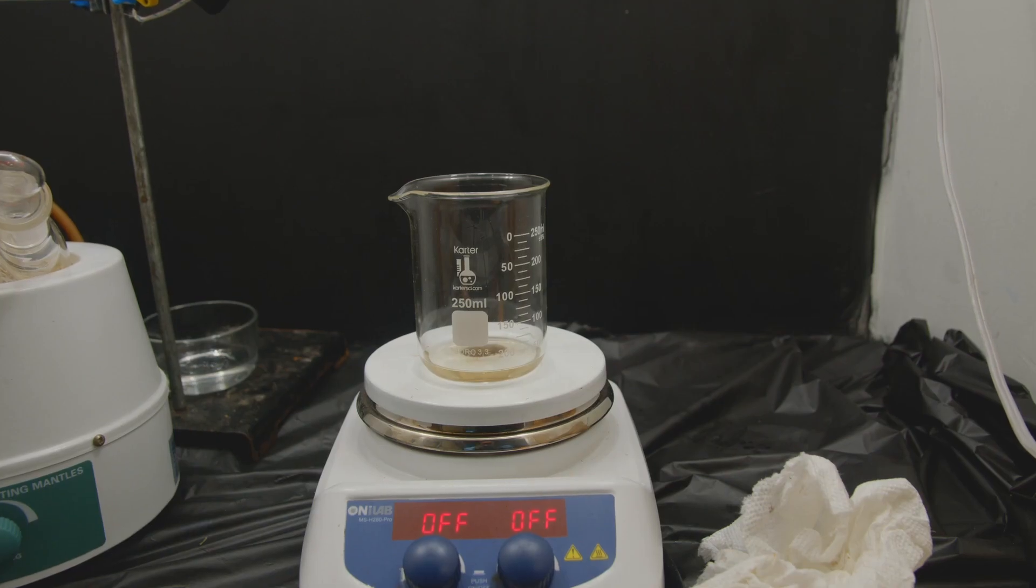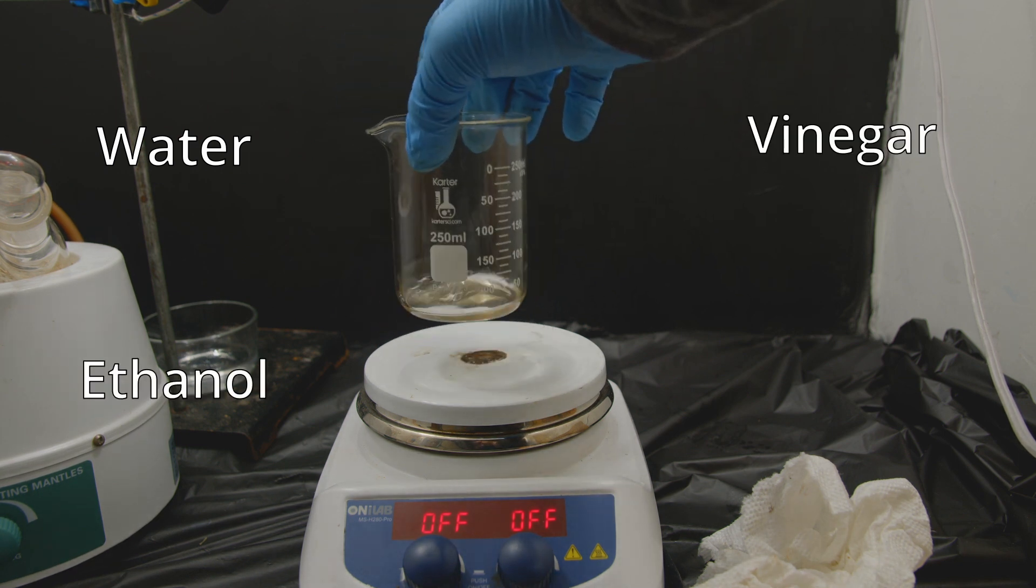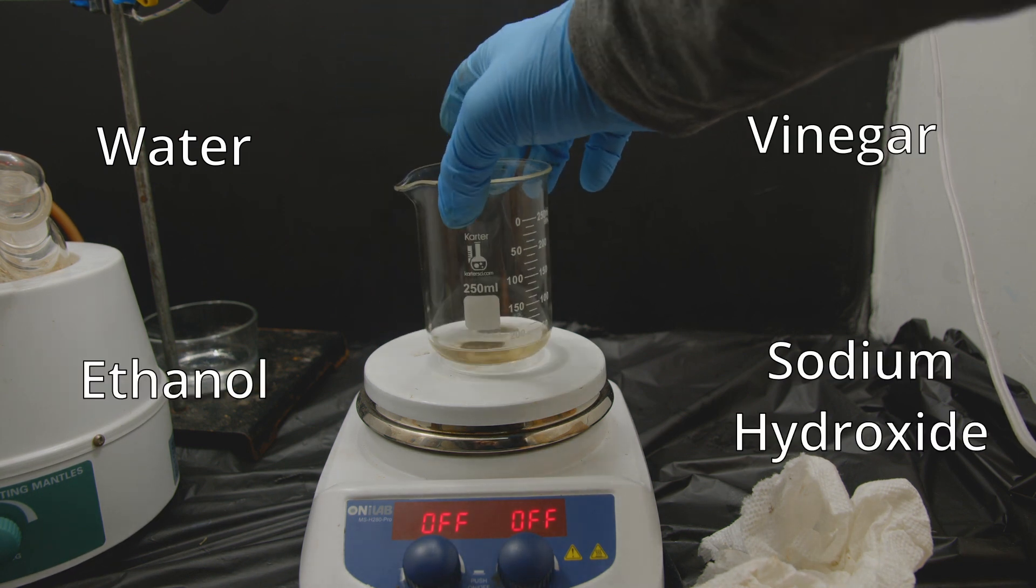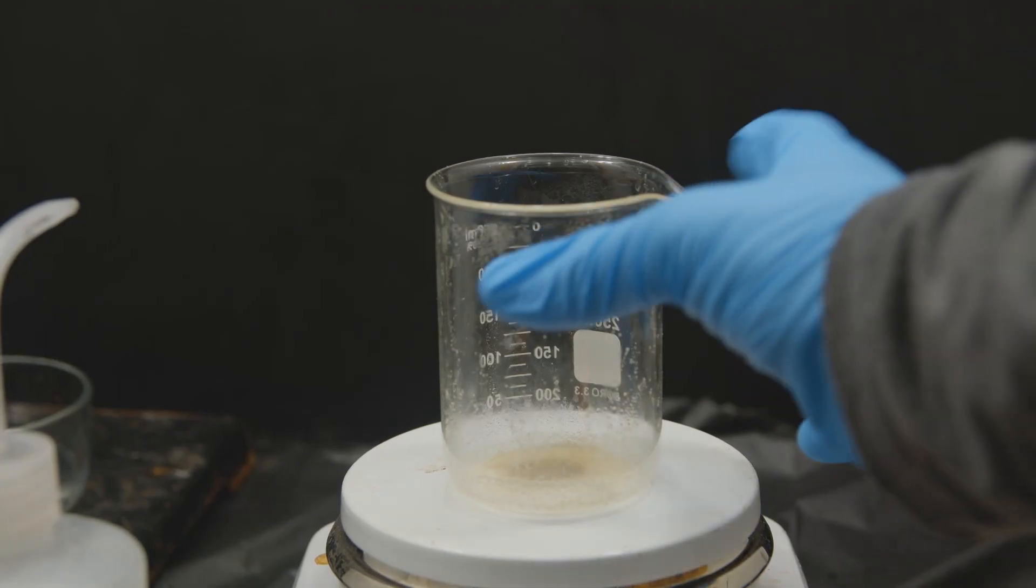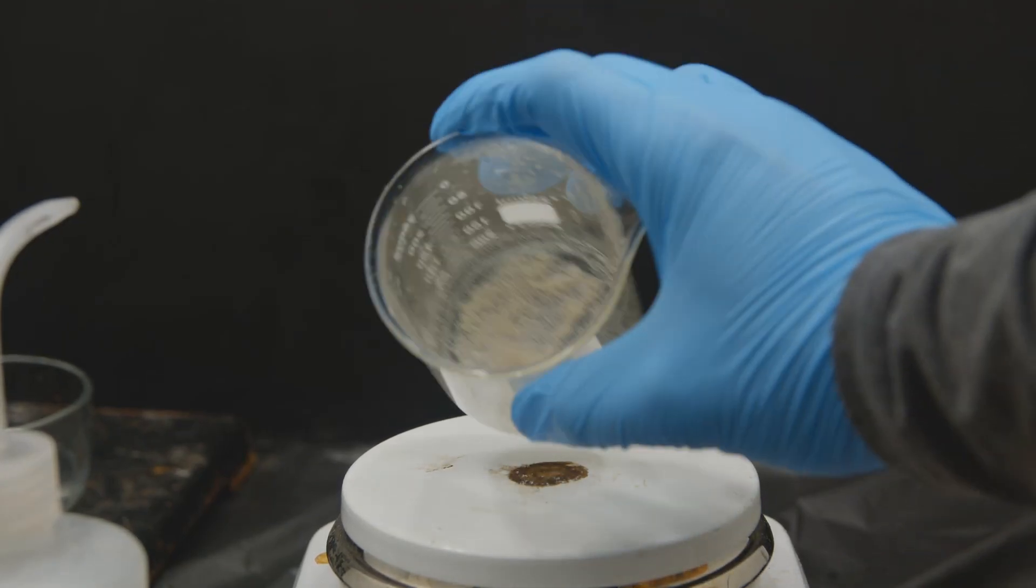So now what I have is a mix of water, ethanol, vinegar, and sodium hydroxide. So to remove the ethanol I boil off the remaining liquid and then I add some water back.